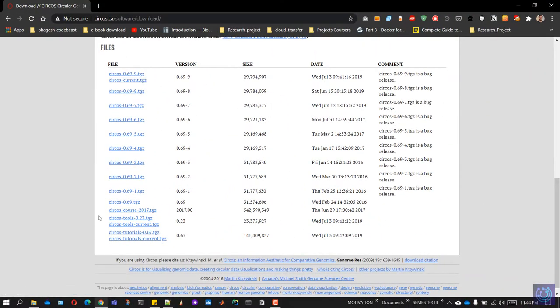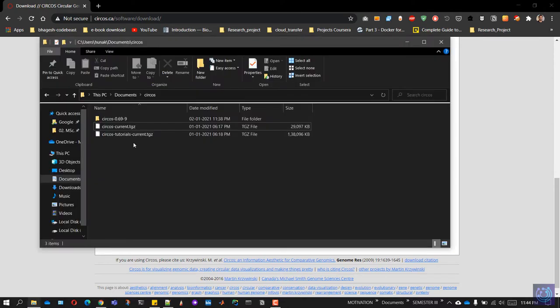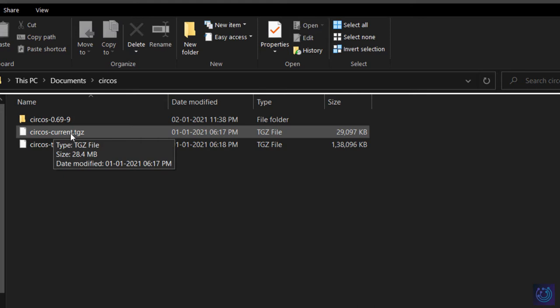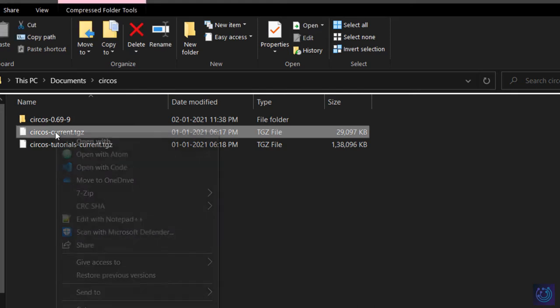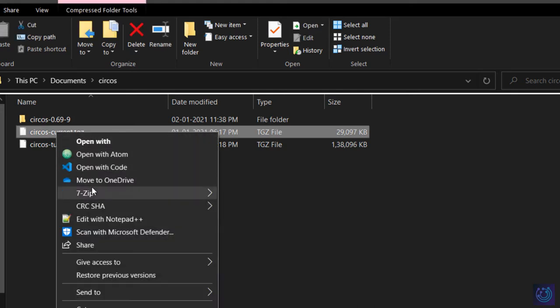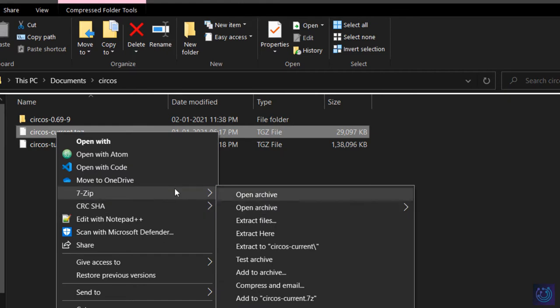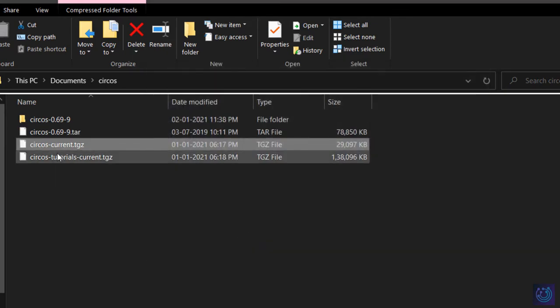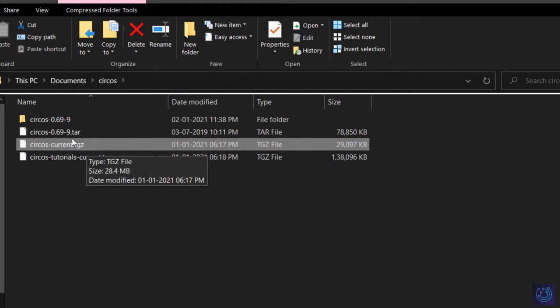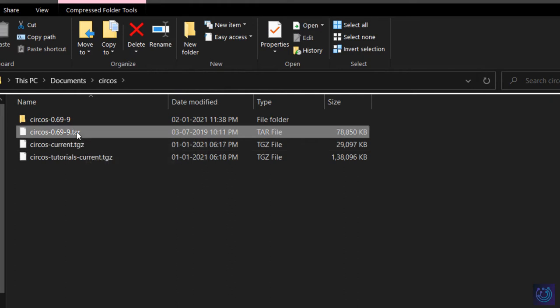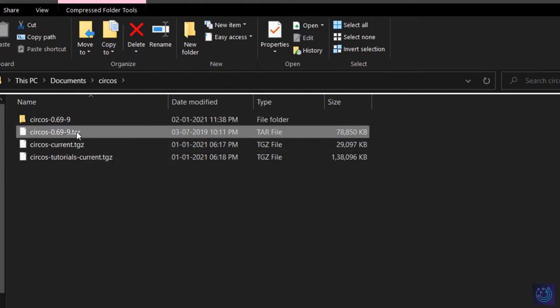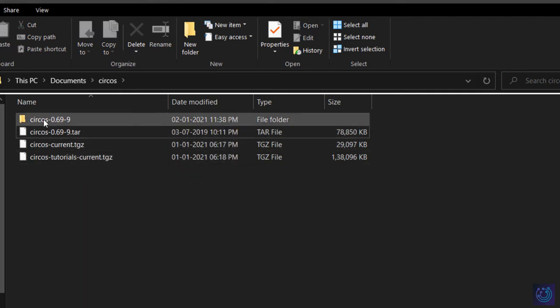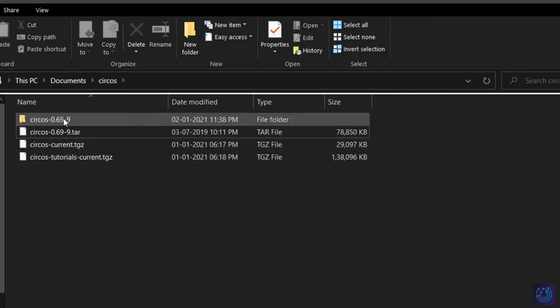Once you have both of these, go to the folder which has these files. We'll deal with Circos current TGZ as of now. Right-click on this and use any unzipping tool to unzip it. We'll have to unzip this twice since it's TGZ. The first will be a tar file, and once you unzip or untar this file, you'll have a folder like Circos 0.69.9 or whatever version you've downloaded.